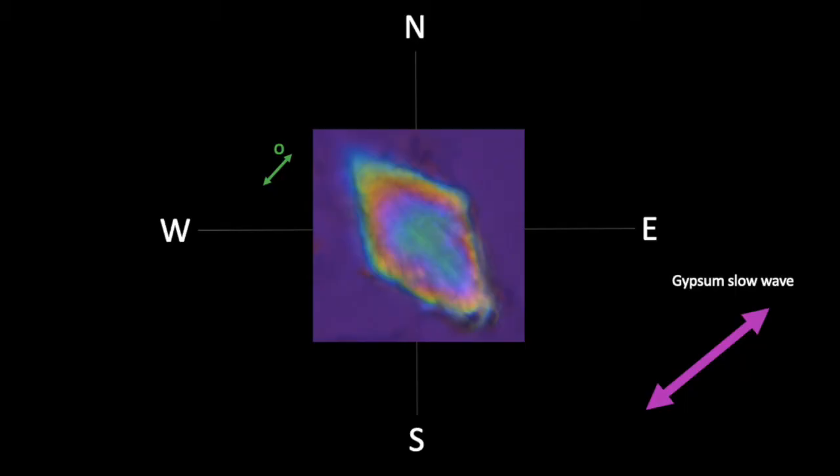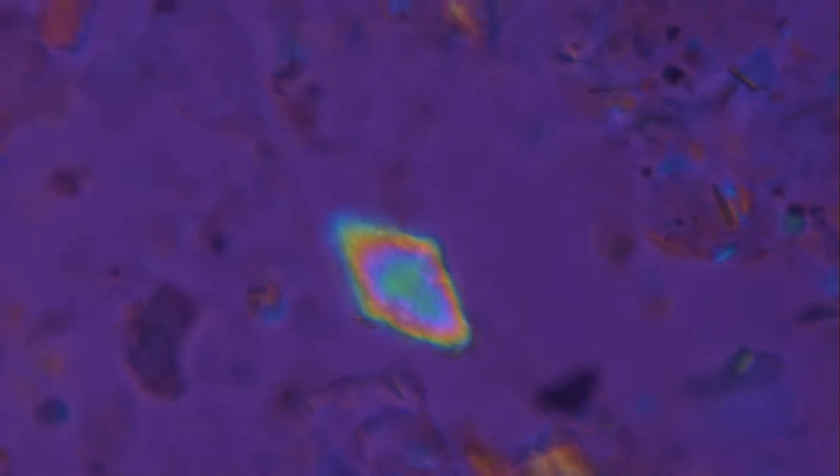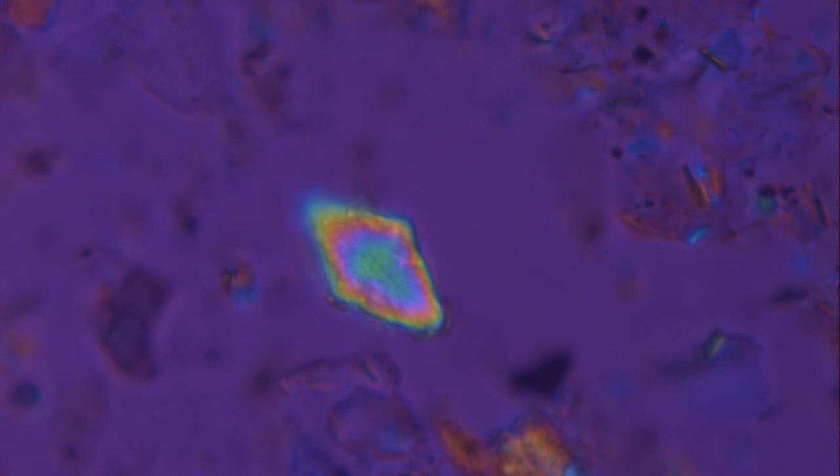In this position, retardation adds, so the slower ordinary ray is aligned northeast-southwest. The first order white of the thinner edges becomes blue, as we have seen before. The reddish purple looks like it kept the same colors, a bit brighter.